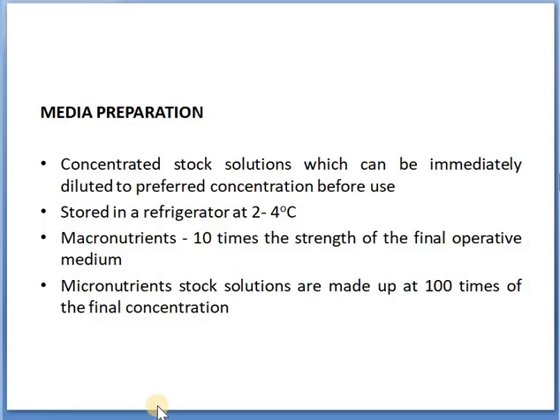A stock solution is a solution of components which is at a very high concentration than what is actually required in the usable or working media. So, this is a very convenient method for doing plant tissue culture. These concentrated stock solutions are then diluted as and when required to the preferred concentration of the working solution before use.